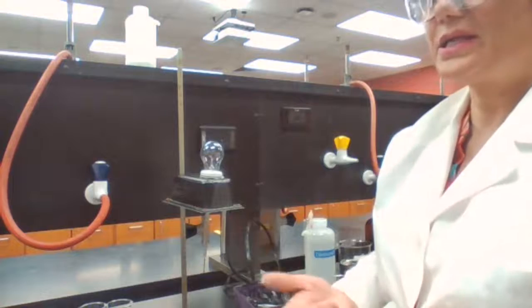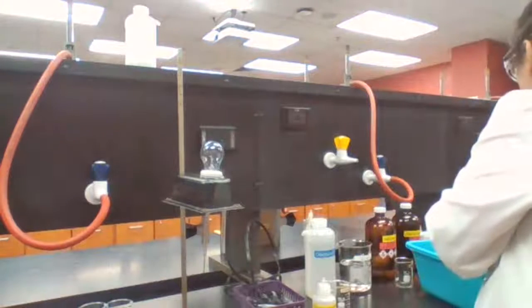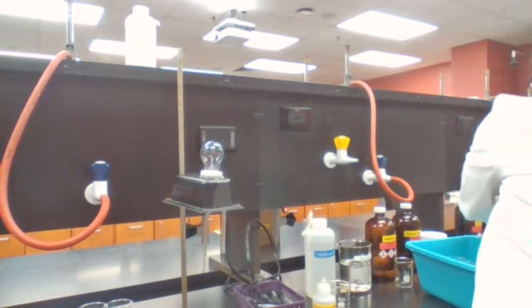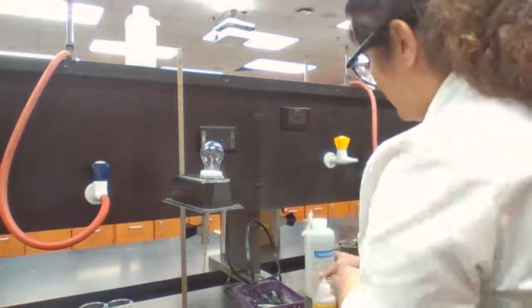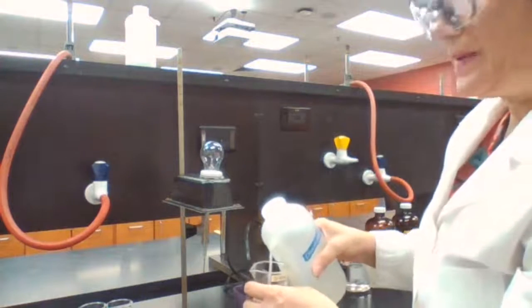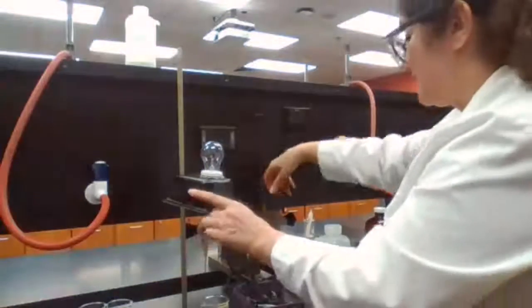That's based on the experiment. I'm going to follow the table that you have for your data sheet, which for me is page 61. Using that table, the first item is distilled water.